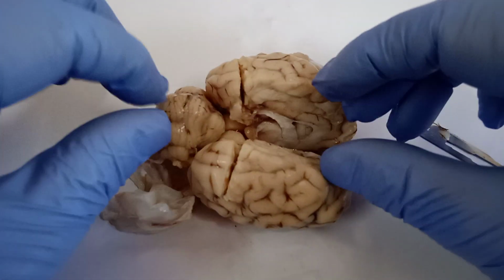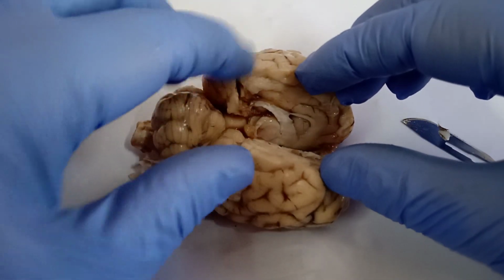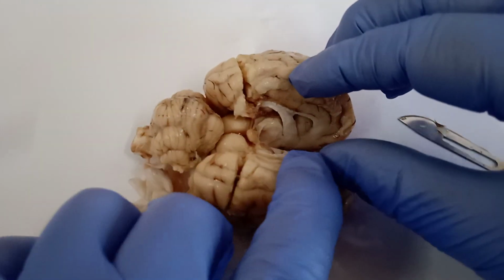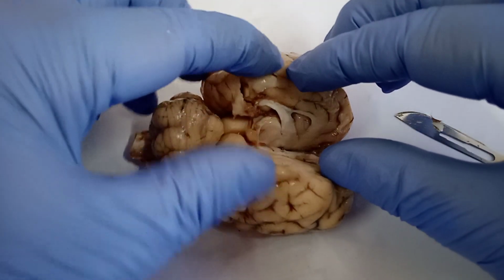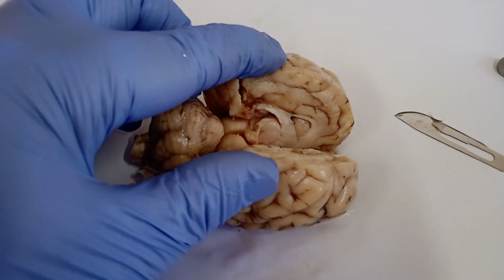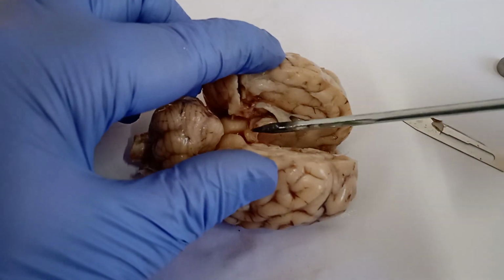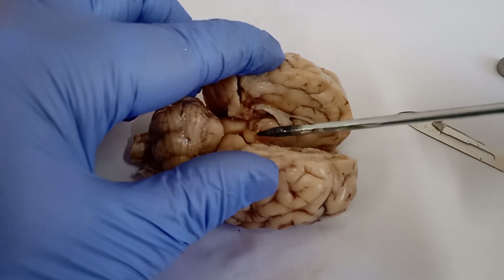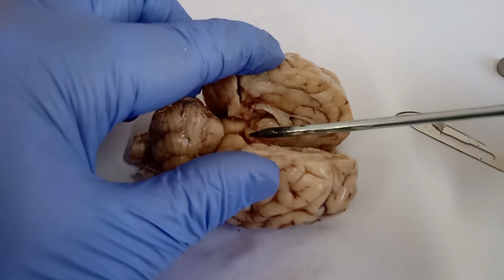Before going further, I have made a half cut here. I have not completely separated these two cerebral hemispheres. Now you can see that almost the two cerebral hemispheres have been separated. But before going to the further cut, if you see this mass here, this is the pineal gland.